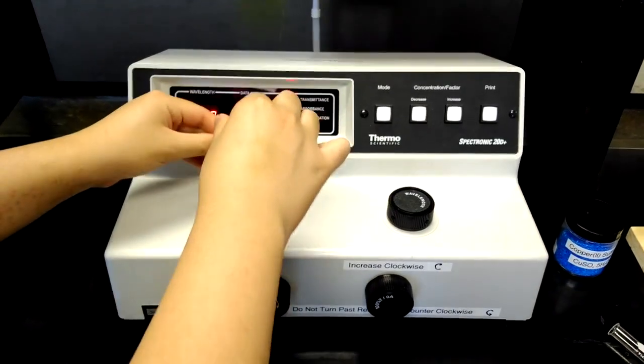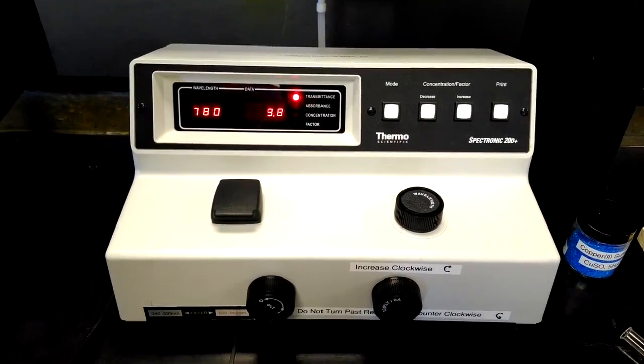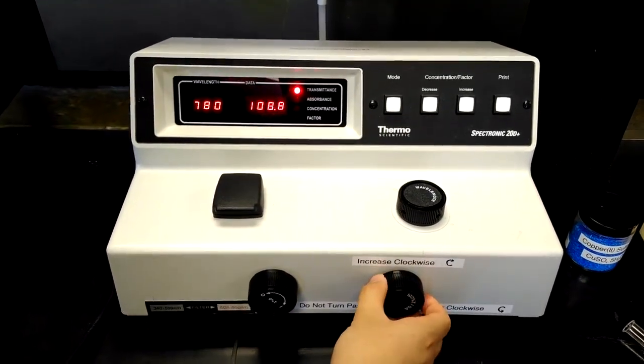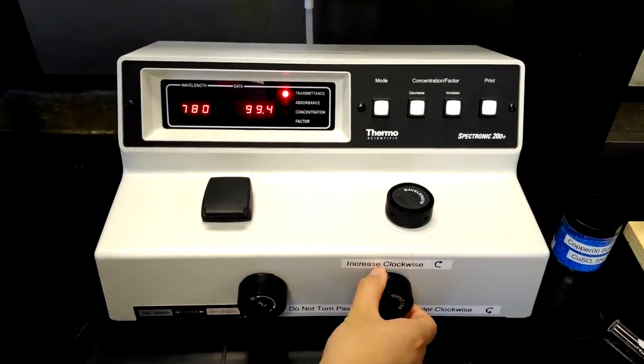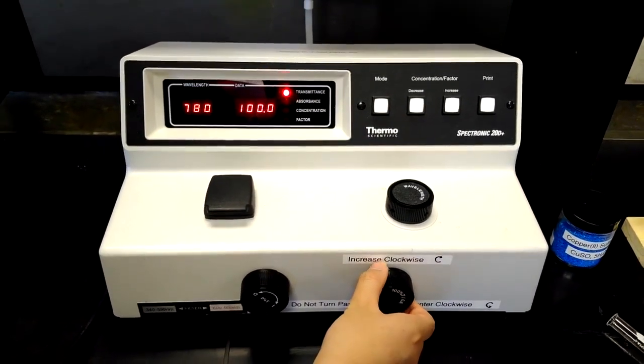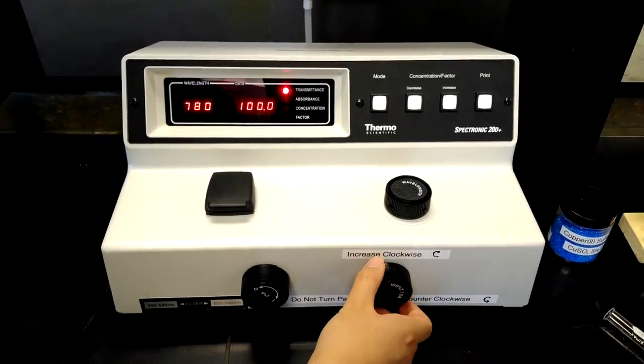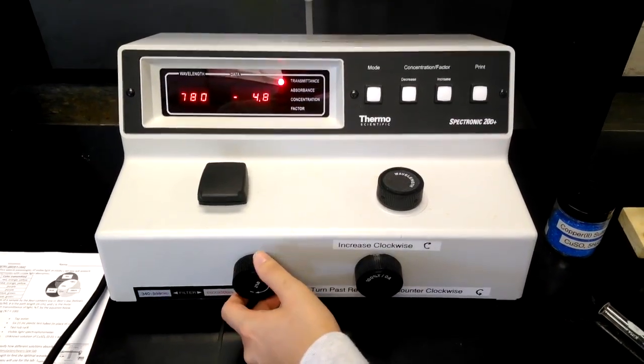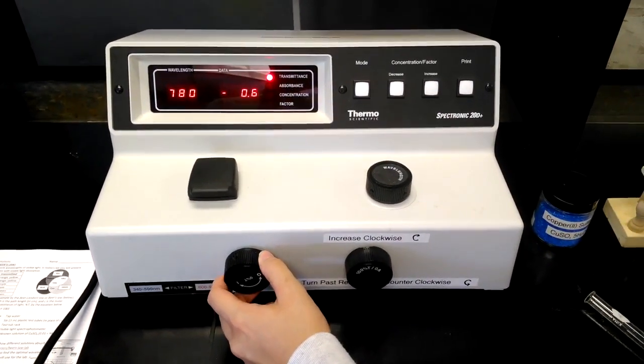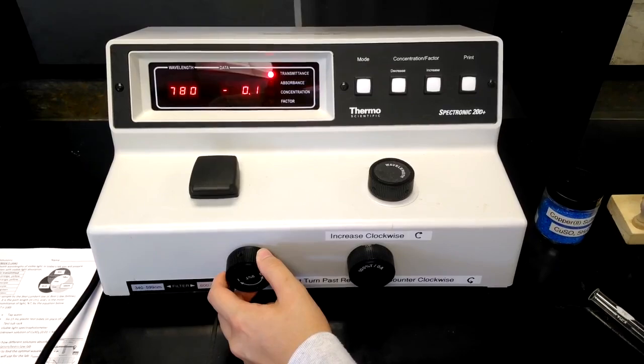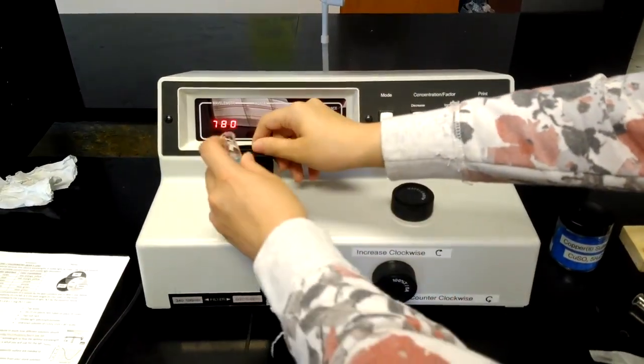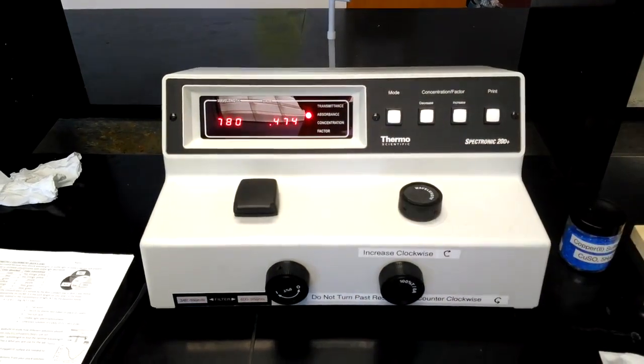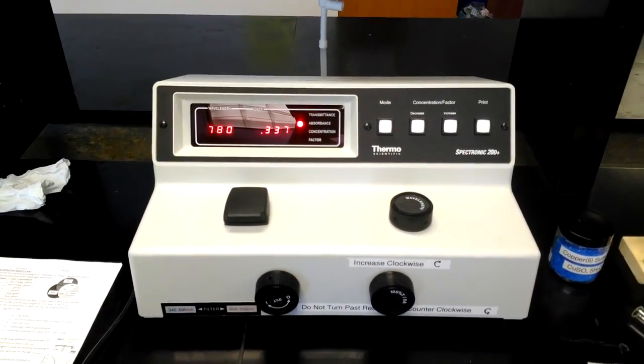Remember to clean the test tube with a kim wipe before putting it into the spectrophotometer. With a blank sample, set the transmittance to 100. In an empty sample compartment, set the transmittance to 0. Change the mode from transmittance to absorbance. Use the spectrophotometer to measure the absorbance of the solution.